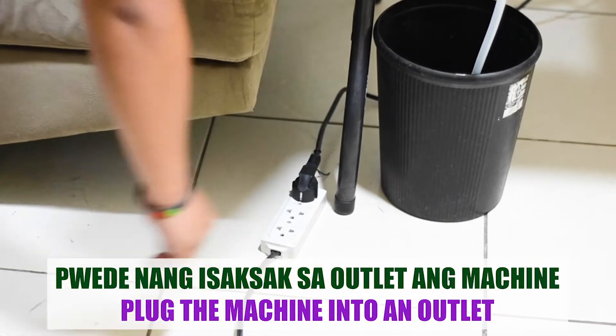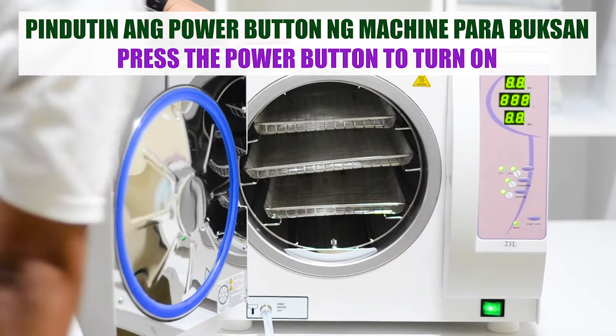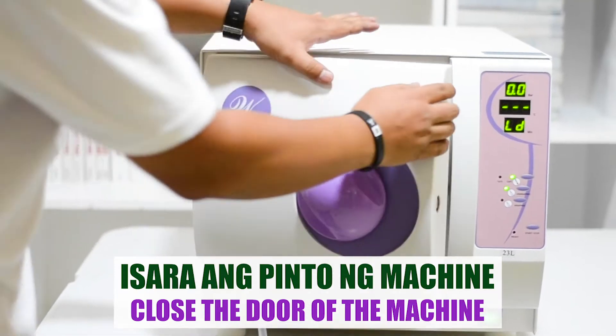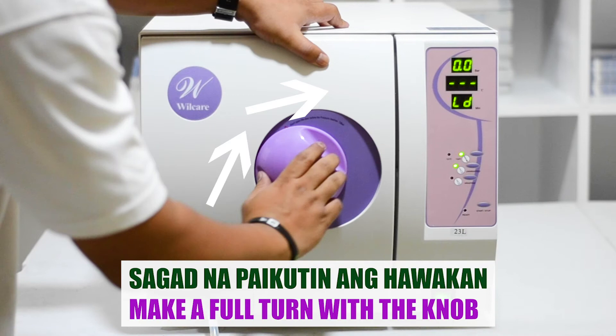Plug the machine in and press the power button to turn it on. Close the door of the machine, then make a full turn with the knob of the door to secure it.